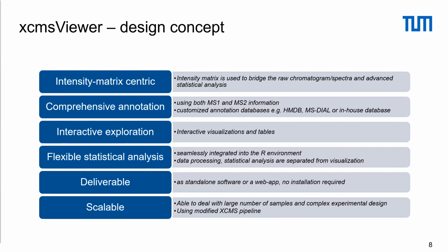So it really facilitates your hypothesis generation, particularly when you need to explore a lot of metabolites. And the next is flexible statistical analysis, because this is seamlessly integrated in the R environment. All the flexibility of R is inherited by XCMS Viewer.